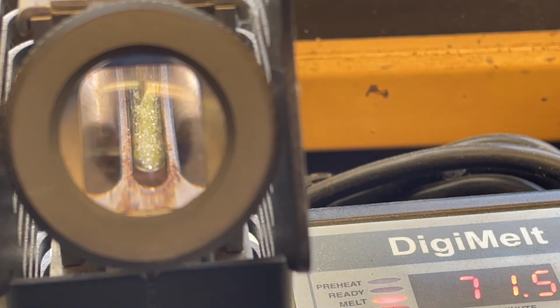Melting point is much lower than the other one. One thing I want you to keep in mind is that it was in water, so if we see a little movement, like maybe even now, this could be due to the presence of water, because I did only vacuum it for 10 or so minutes, so it's not technically super dry, and this does in fact affect the melting point.